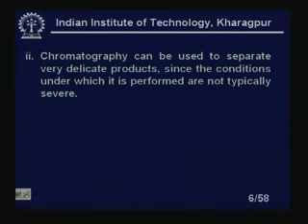That means temperatures and moisture are not extreme, so at normal room temperature you can do it. That is why very delicate compounds and very delicate complexes of gases can be nicely separated in this particular system.